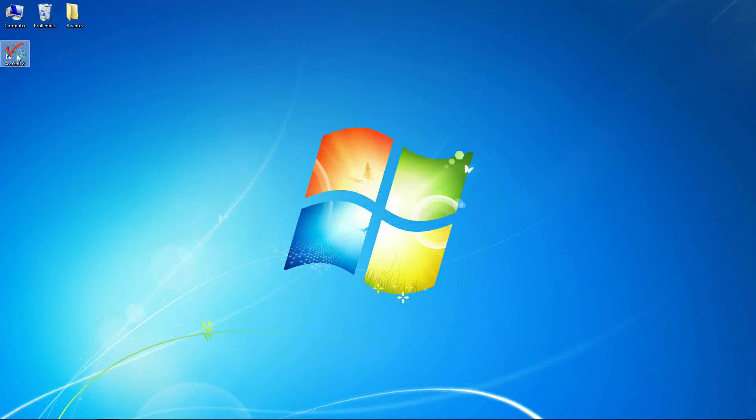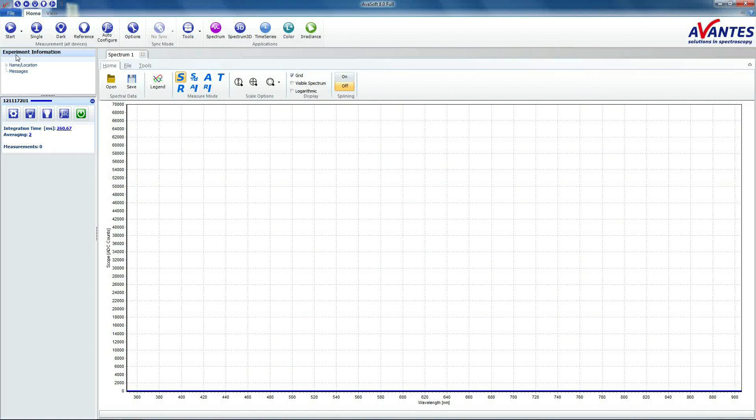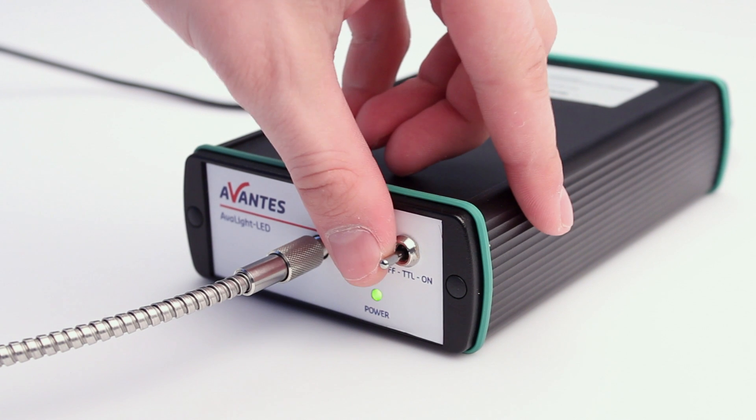Now start up Avasoft 8. To start a measurement, click Start in the upper left corner. Please turn on the lamp.